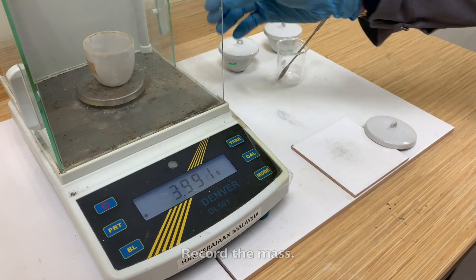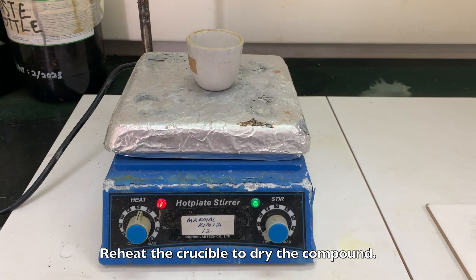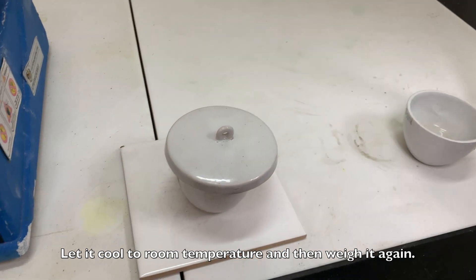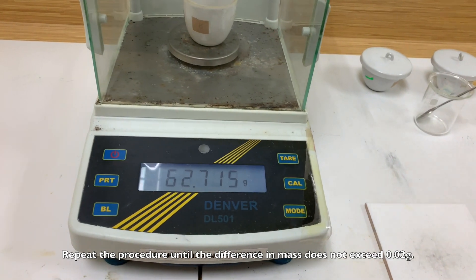Weigh the crucible and the compound and record the mass. Heat the crucible to dry the compound, let it cool to room temperature, and then weigh it again. Repeat the procedure until the difference in mass does not exceed 0.02g.